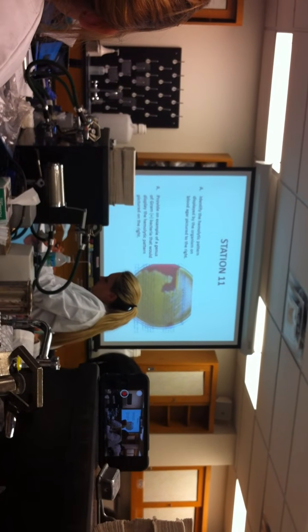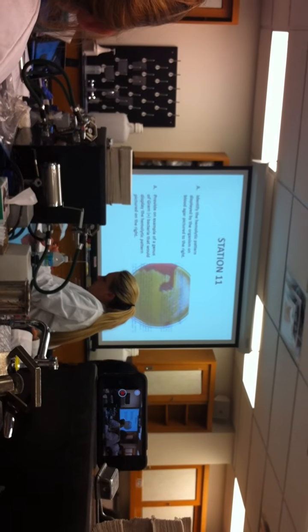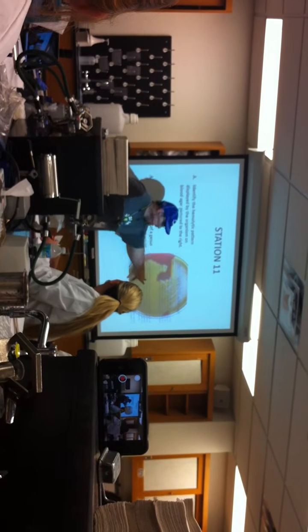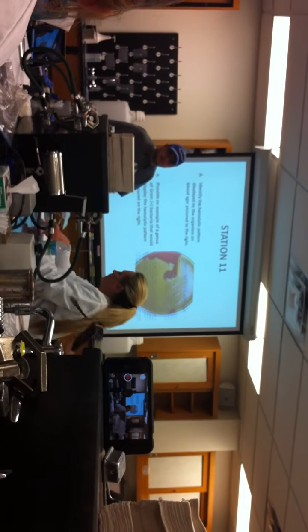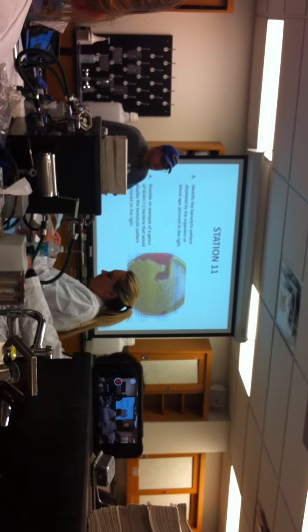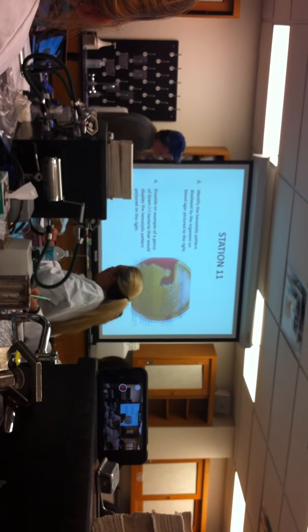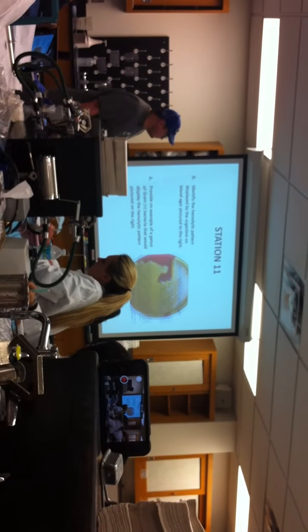Okay, this is a picture of blood agar. How do you feel about that picture of blood agar? What kind of blood agar is this? You guys can see straight through and read through it. What does that mean? What kind of hemolysis is that? Beta is when it's complete hemolysis. So you can see through it. That's beta hemolysis. So, beta hemolysis is what we're seeing there.